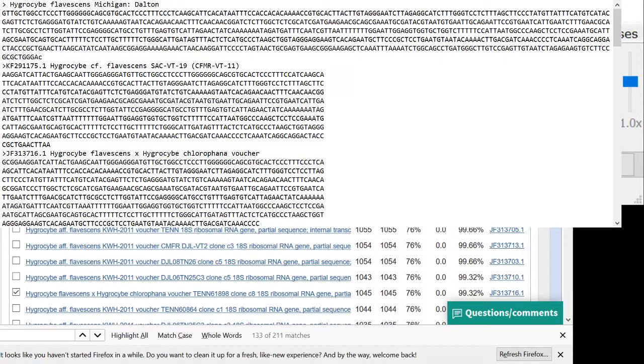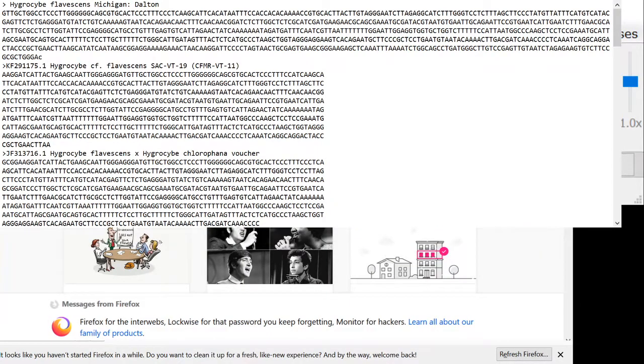And now we have a lot of ways to generate phylogenetic trees. People have been doing this from sequences for about 20 years, but they've been generating phylogenetic trees using other character states that are not sequence-based for hundreds of years, really. In the last 20 years, they've developed a lot of algorithms for making phylogenetic trees. What they all have in common is that they try to use math to calculate how all the species in your tree evolved. So the easiest and quickest way to make a phylogenetic tree is to use a website called phylogeny.fr.